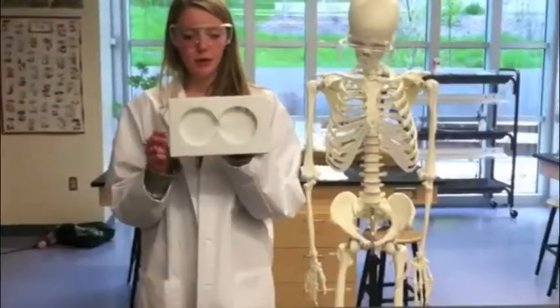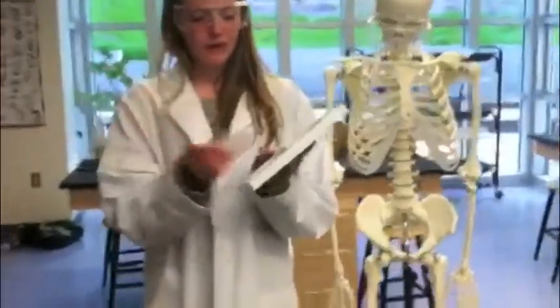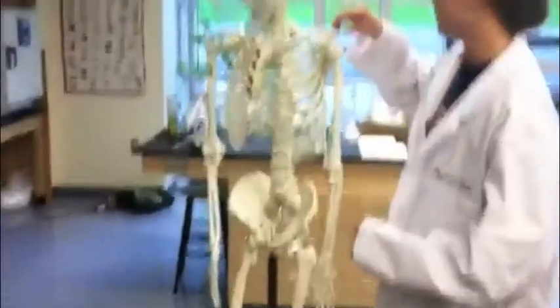We will be using 2 joint petri dishes in this experiment. Take 2 circular filter papers and tape them into the bottom of each, like so. Then, place a small piece of tape over the bridge in the middle so that the termites will be able to move. Then, you have to collect your organisms and place 5 on each side.